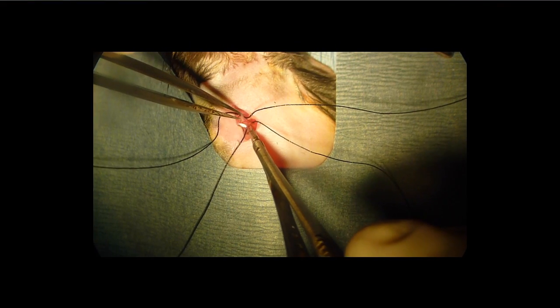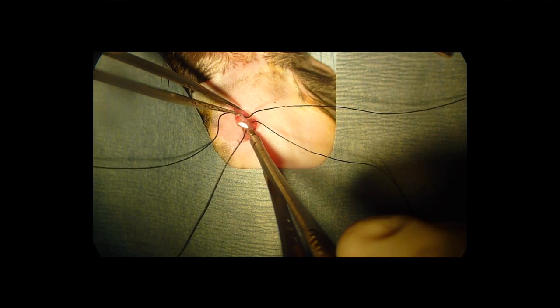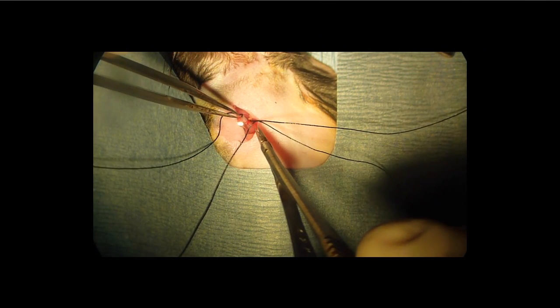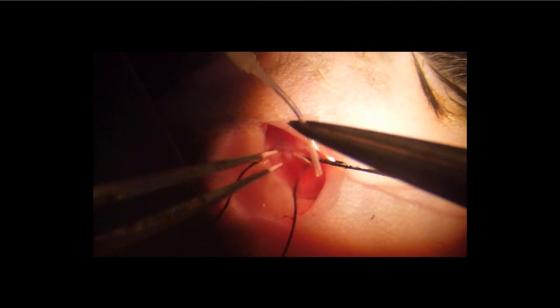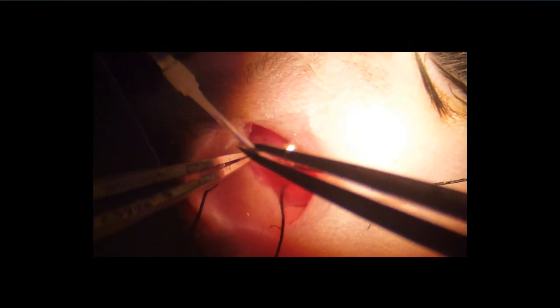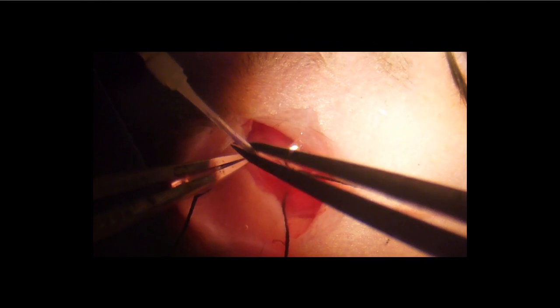Perform a venotomy using microdissection scissors just proximal to the ligating suture. Insert the mouse jugular catheter into the vein and advance 4 millimeters.